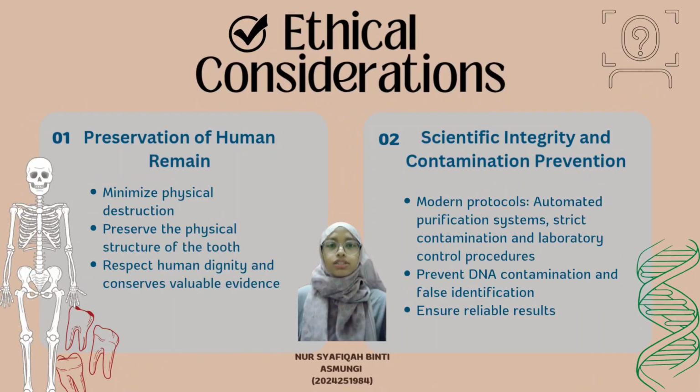Moreover, this article strongly emphasizes ethical consideration. Unlike traditional DNA extraction methods that often involve drilling or crushing teeth, permanently damaging human remains, this advanced non-destructive method helps preserve valuable evidence and respect cultural and religious concerns. It also highlights the importance of scientific integrity and contamination prevention, where strict contamination and laboratory control procedures are necessary to prevent DNA contamination and false identification to ensure reliable results.